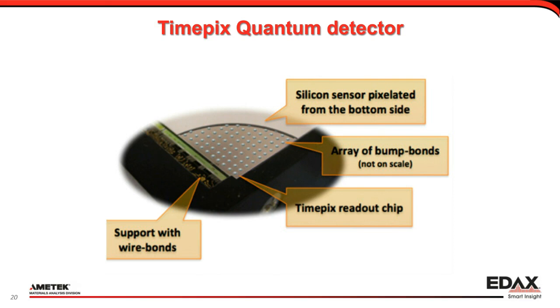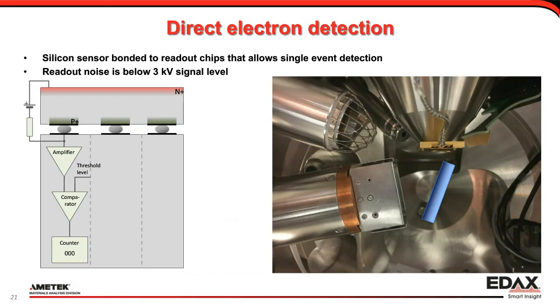Now, just to show what that looks like, this is a picture from the microscope I have here in the Tilburg office. There's the detector itself. There's a tube with the front end where the chip is. There's the sample. In this case, the stage is mounted on the door of the microscope, so I could not take a picture like this in color with the sample in situ, so I just put a virtual sample in there, but that's about the position of the detector, and it's between 2 and 3 centimeters away from your specimen.